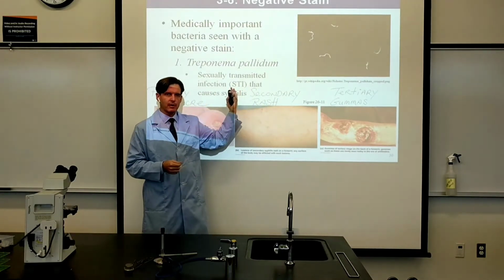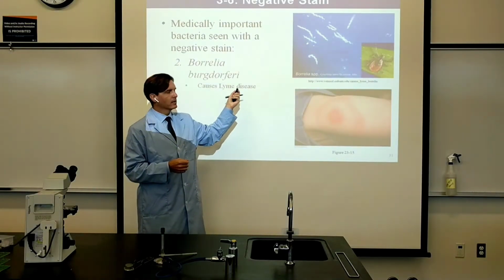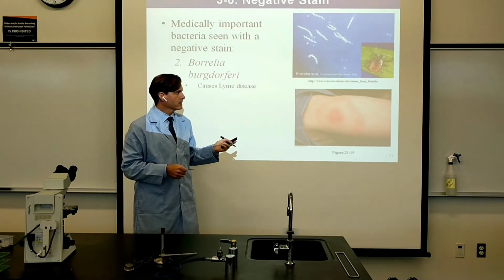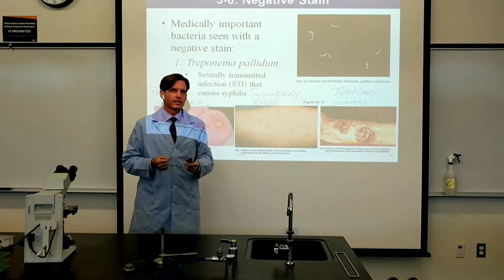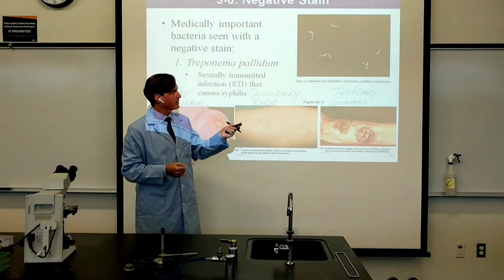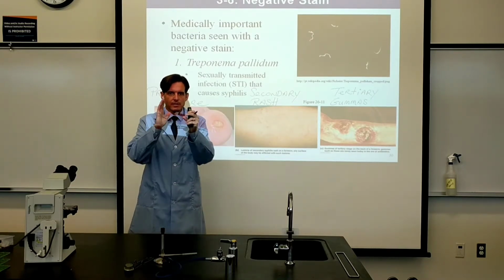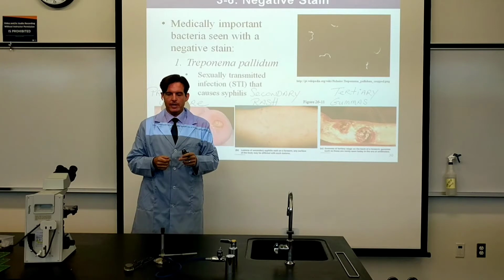We talked about some dangerous spirochetes like Treponema pallidum, which is the cause of syphilis, and we talked a little bit about Lyme disease, which is caused by an organism, Borrelia burgdorferi. And not all spirochetes are guaranteed problematic. To give an example, Treponema denticola is an organism that can look like little squiggly, wavy lines under the microscope, and they do come from people's gum line, or where the teeth meet together, which provides an environment where sometimes non-pathogenic Treponema bacteria can be found.